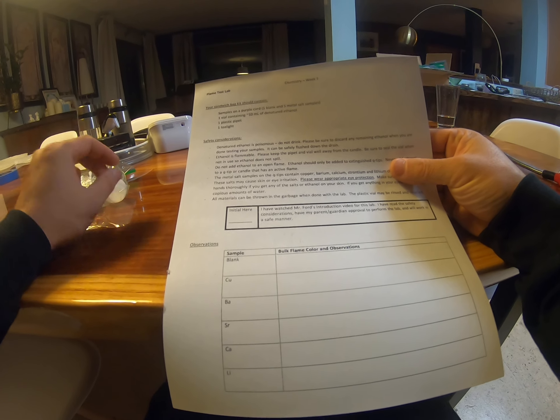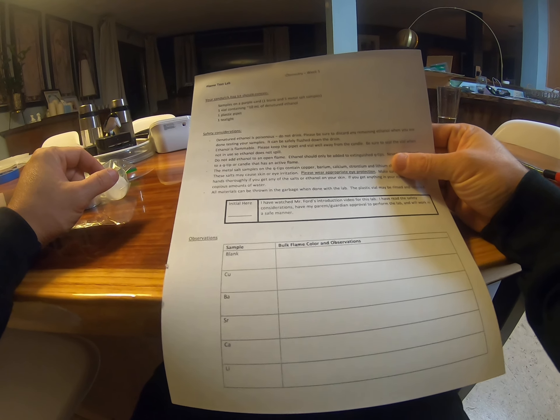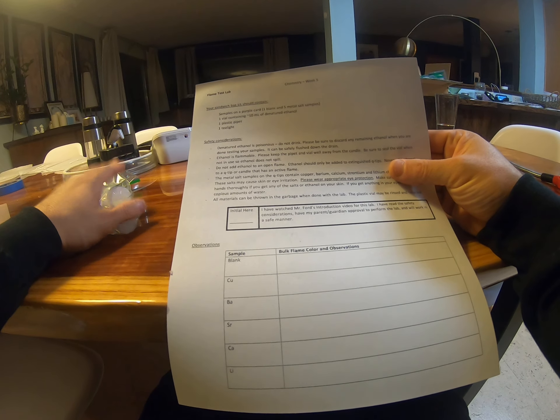Alright chemistry, so I'm assuming you're going to be heading home from the library. You've picked up a lab sheet and you've picked up your kit. So before you open the kit, let's just go through this.